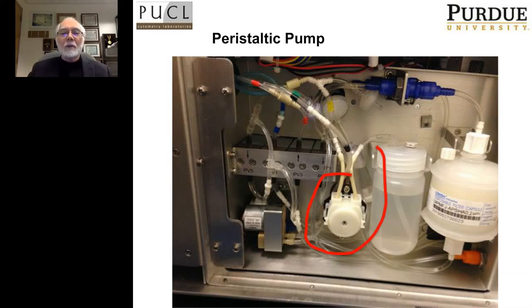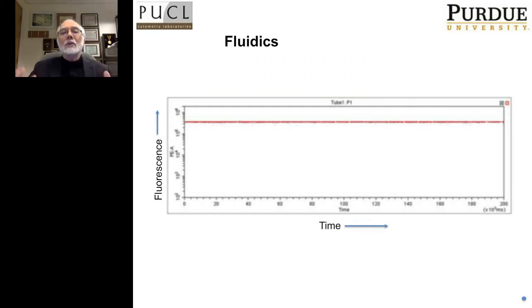So that saves us from having to struggle with a potential pulsation problem. And from my experience, this works very well. Now, the other question is, can you get stable flow? This is a very reasonable question to ask.